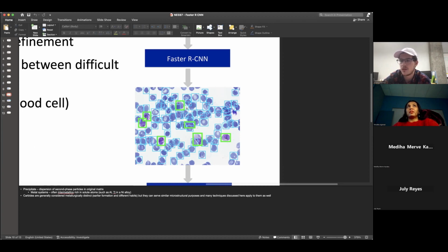So it's just something that doesn't improve. It's the initial step, where you break your image into multiple small parts, and that's getting trained, right? And it's not improving the initial image. Exactly. Because at the end of all this, you always have that bounding box regression step, where the bounding box is improved to better isolate the feature. In selective search, that bounding box regression never actually reaches the selective search algorithm. So these iterations don't actually improve it. That's why it's computationally heavy, I believe.